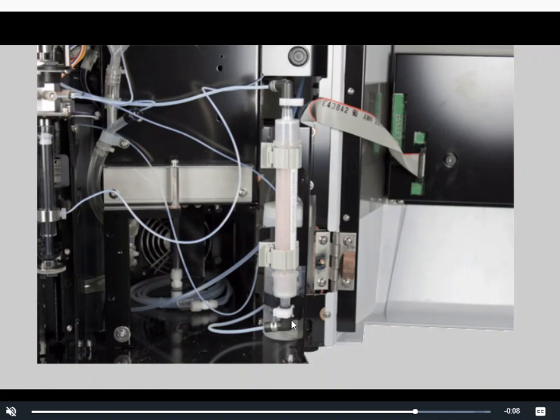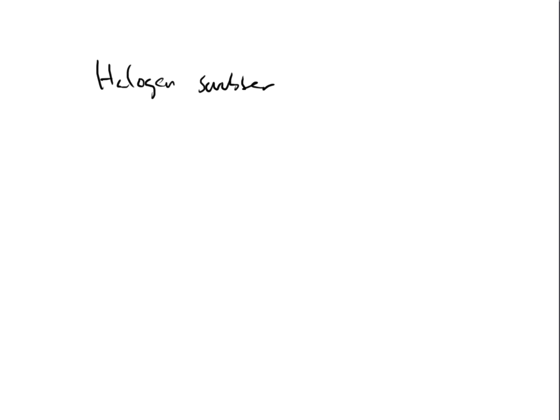Now, I told you that during this time, there's kind of a key on what you need to be looking for in your halogen scrubber. You know, how do I know if it's time to replace that halogen scrubber or if I'm just wasting money? Well, some people are going to waste the money. Some people are going to replace the halogen scrubber on a routine basis over and over and over, whether or not they need it. And here is kind of my guideline to you about the scrubber.